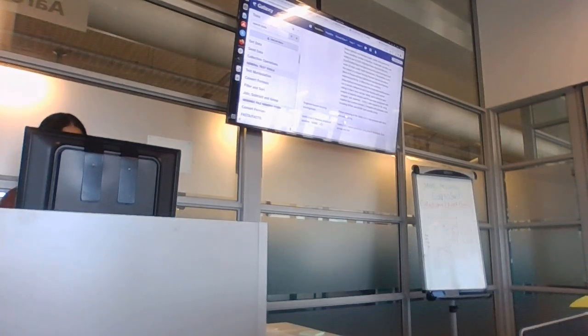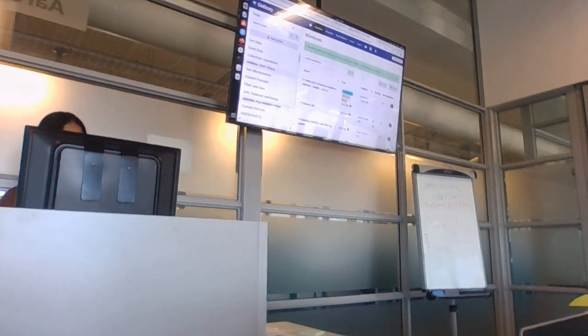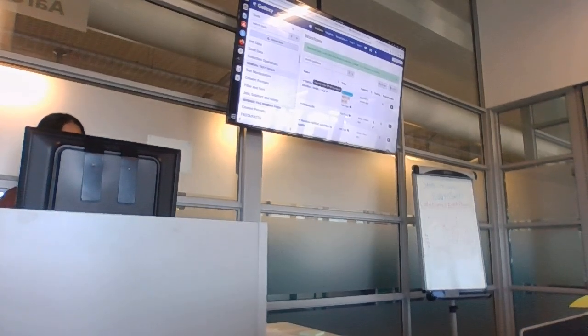If you click on it, this box opens up and then you can just click this and it will import the workflow. And you will now see the workflow is under your workflows tab. So you can actually go to a public database and look at pipelines that other people have created and import it into Galaxy and run it in the same way that you would run the workflow that you created.